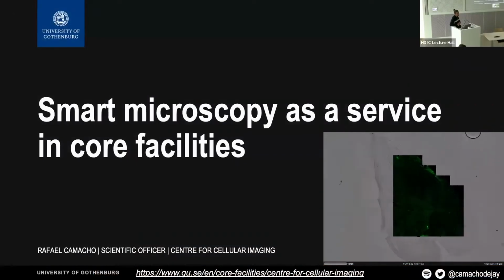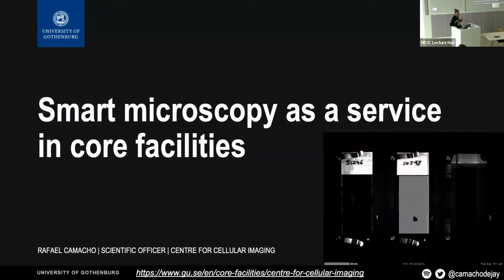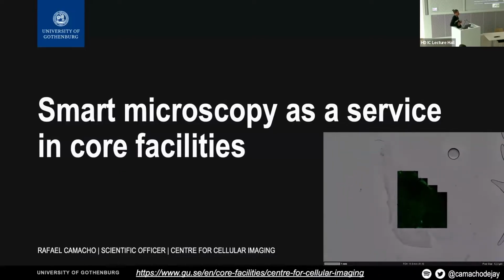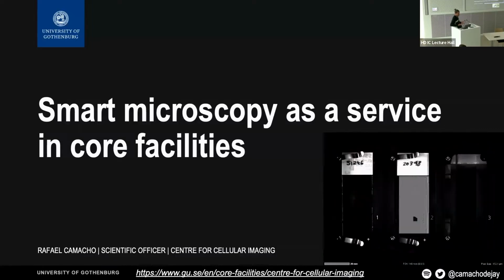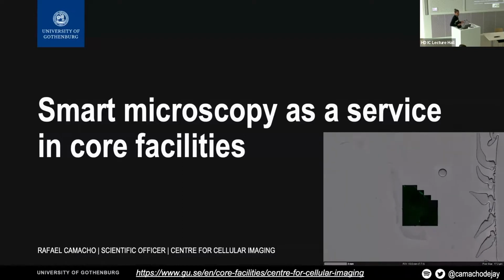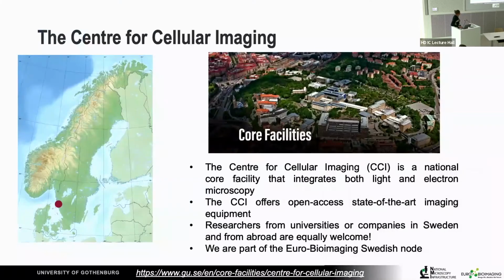What I want to introduce is, of course, the topic. What do we mean with those words, smart microscopy? And also what I will show you, which is much more interesting for me, is offering smart microscopy as a service in an imaging facility, and what might be different from what you would do in a research group, right? So first of all, just to let you know where I come from.